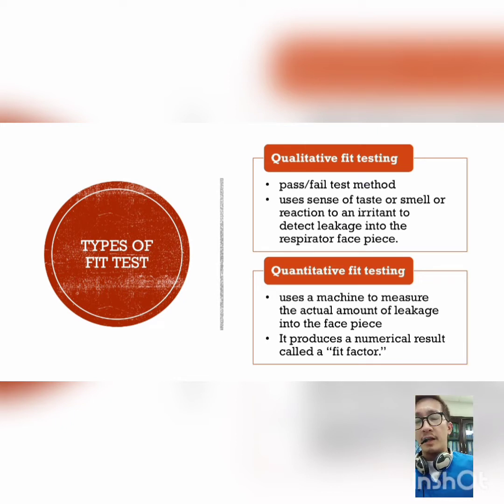In other words, qualitative fit testing is more of a descriptive type of test. The description of the one being tested, whether he or she senses taste or smell, or reacts to the irritant, would determine the result of the fit test.